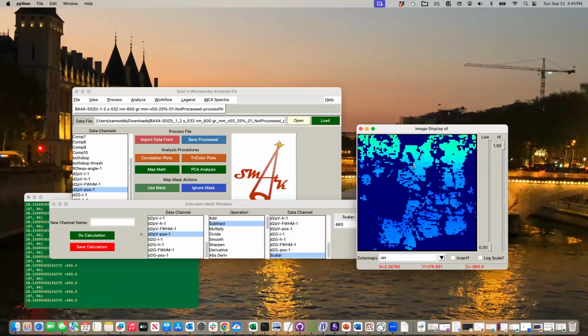There could be a Raman shift because the crystal orientation is changing, and we're getting a slightly different axis, or it could be a crystallinity effect as well in this case. That could also give a small shift. So obviously there would be some really cool things to be able to do, to go look in and maybe look at the spectra of the minerals in these regions, and see what other chemical differences might be happening.